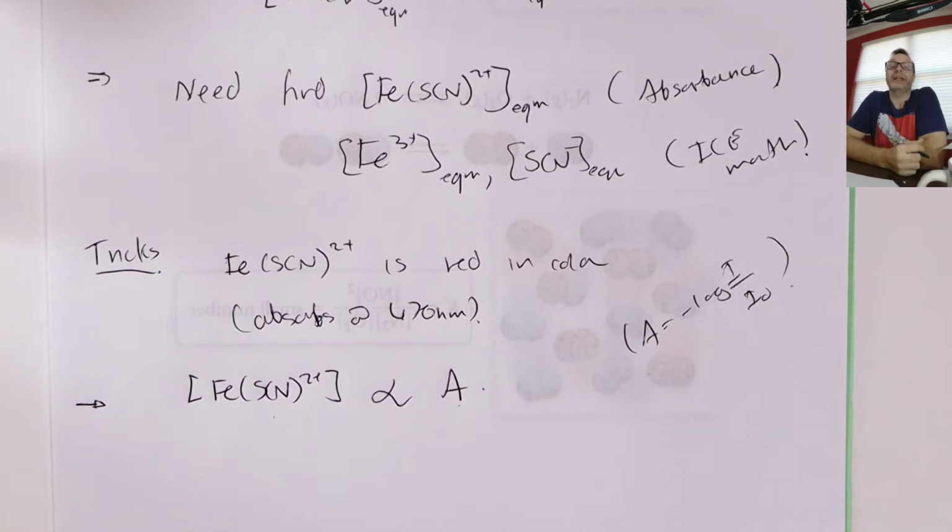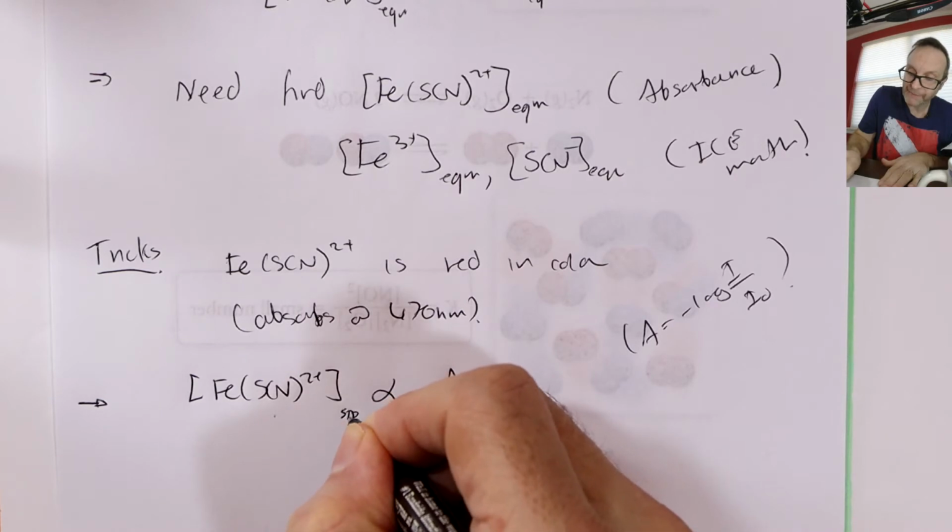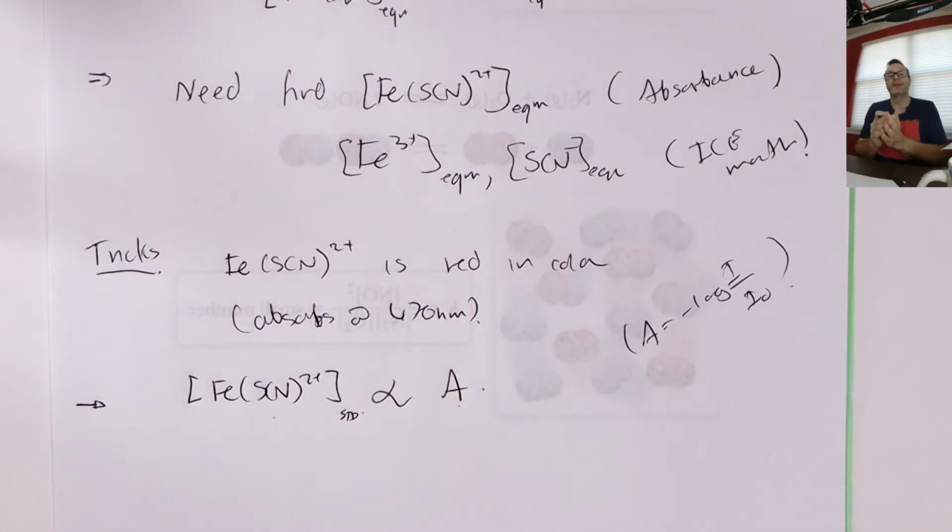And then that absorption is proportional to concentration. So what we actually do is draw a line in the sand and work out in lab the absorption for a known concentration. We call it a standard. So make a standard, and we put that standard of known concentration in the spectrometer and record its absorption. Whatever the absorption happens to be, maybe it's 0.6 equals 0.002 moles per liter or something, right? And then we know that relationship and we can do some clever math.